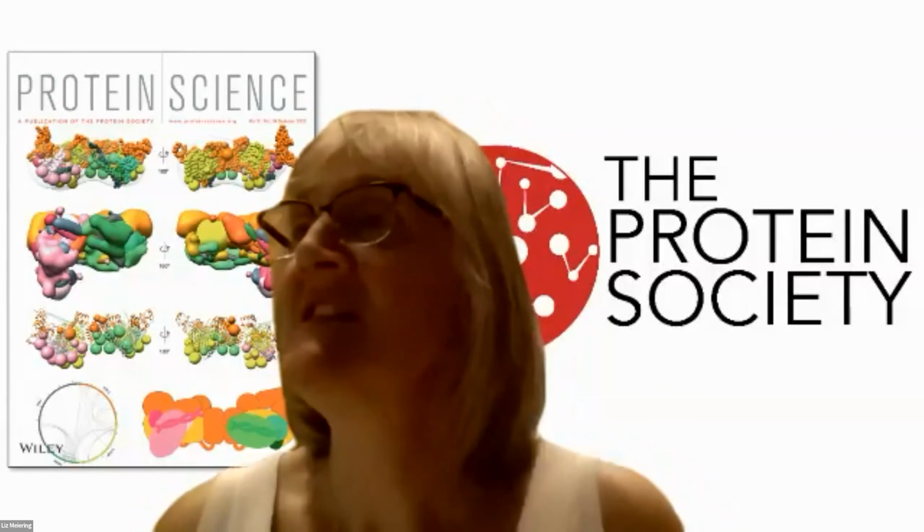Wonderful. Wow. Okay, I have a question here from Quentin Smith. From the 8 angstrom structure, which had 1 RNA and 10 proteins, do you see dynamics, intermediate structures without several domains, or is the telomerase complex stable once complete? I guess that was something I wondered about too, the dynamics and intermediates of the system. It's a good question. The way we purify is really to try to ensure that it's a complete complex before we put it on the grid. So we don't see so much, as I mentioned, it's quite compositionally homogeneous. We eliminate part of the problem already in the purification method.